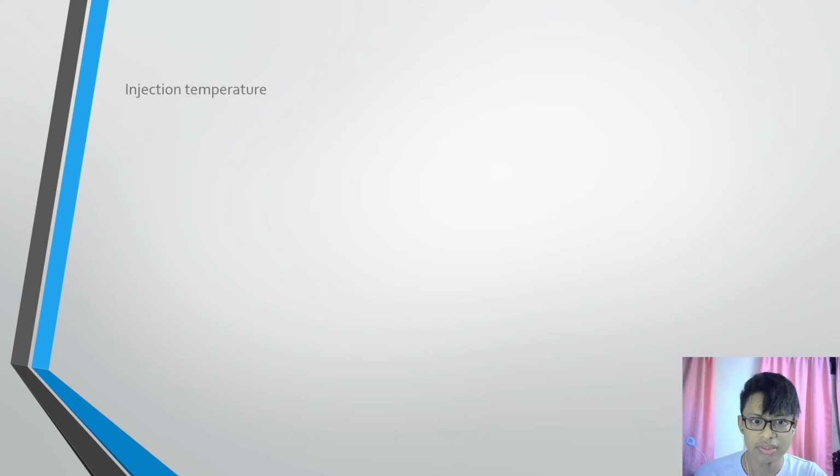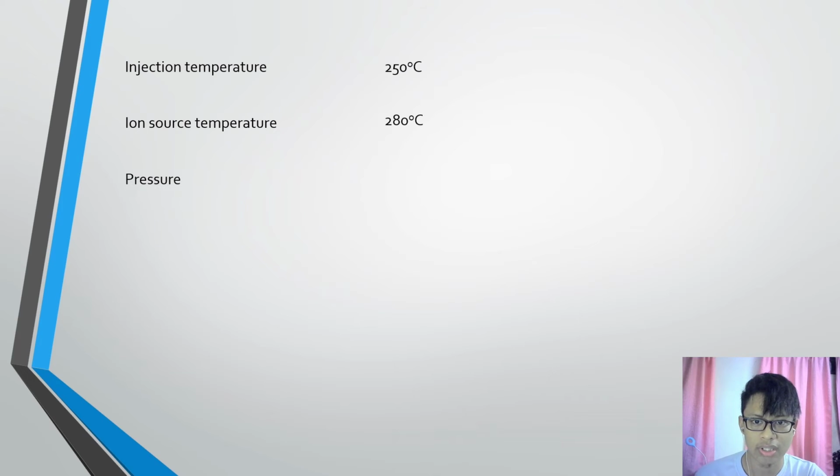The injection temperature is 250 degrees Celsius. Then, the ion source temperature is 280 degrees Celsius with the pressure at 48.745 kilopascal.